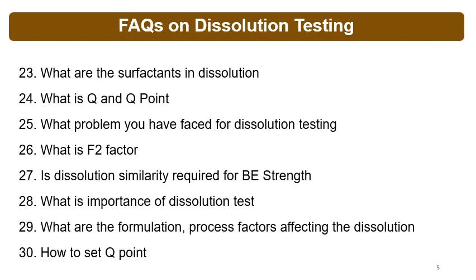What is the importance of the dissolution test? The dissolution test is a performance test for the formulation which predicts the in vivo behavior. SUPAC changes can be justified by dissolution testing. Biowaivers can be taken based on the dissolution justifications. Then site changes, manufacturing changes, and API changes can be justified based on the dissolution test results.